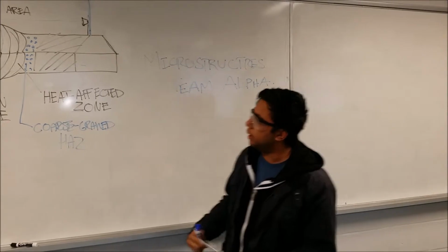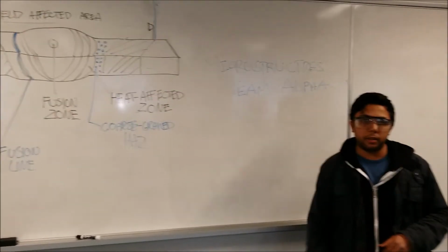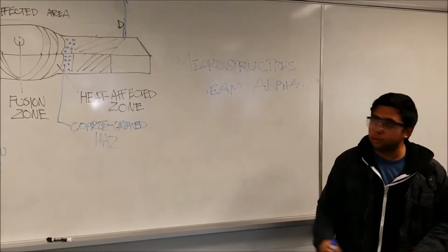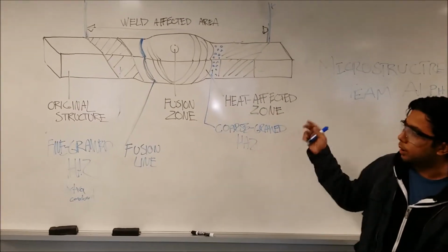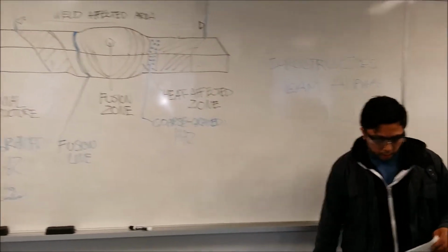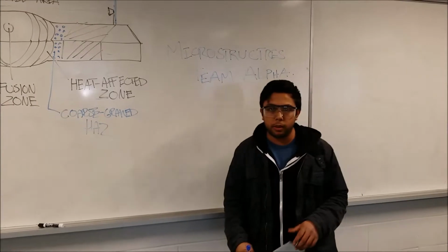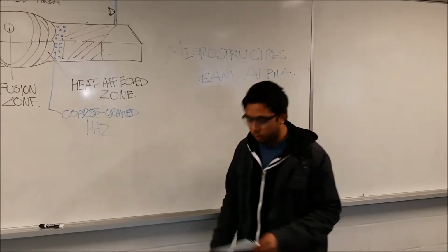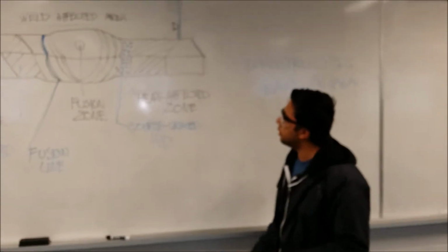of a heated sample or a welded sample. The purpose of this experiment is to analyze the microstructure of two samples, a high to low carbon sample and a low to low carbon sample, and also correlate each zone in the sample with a microstructure. There are going to be 5 zones analyzed in this situation.